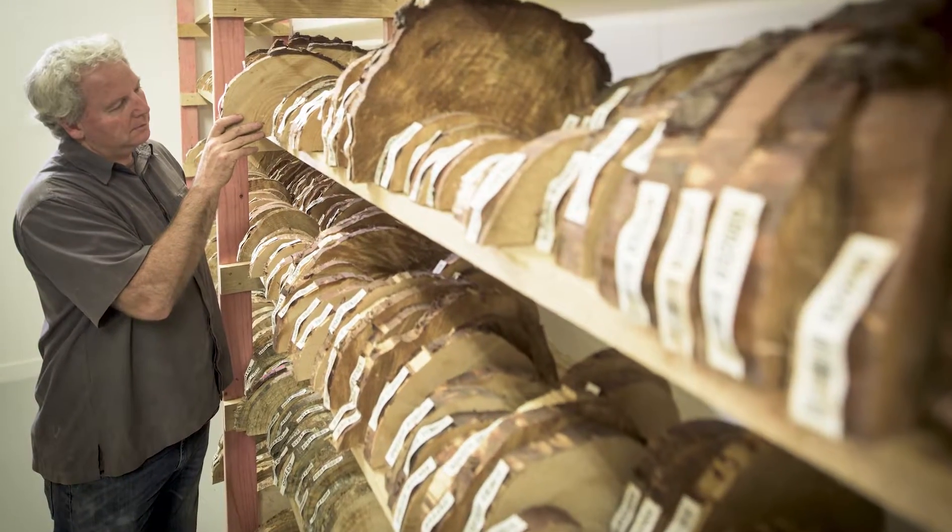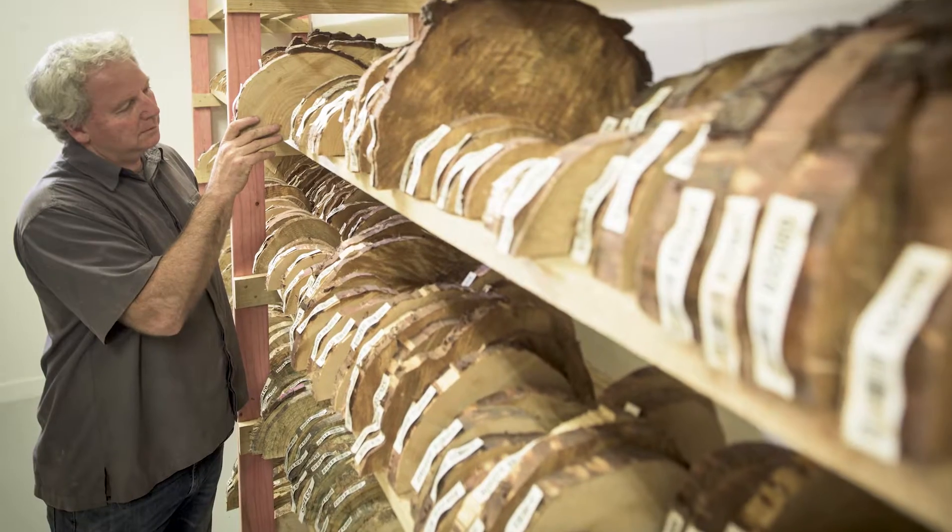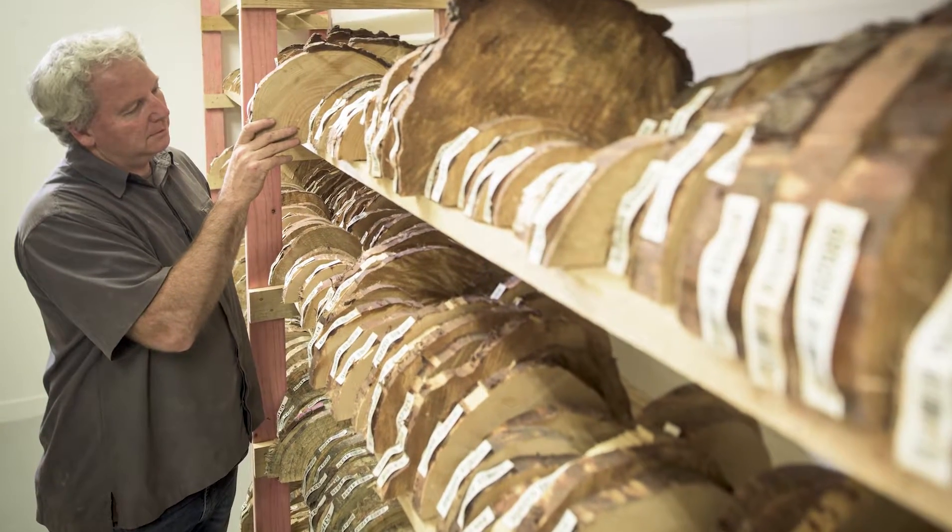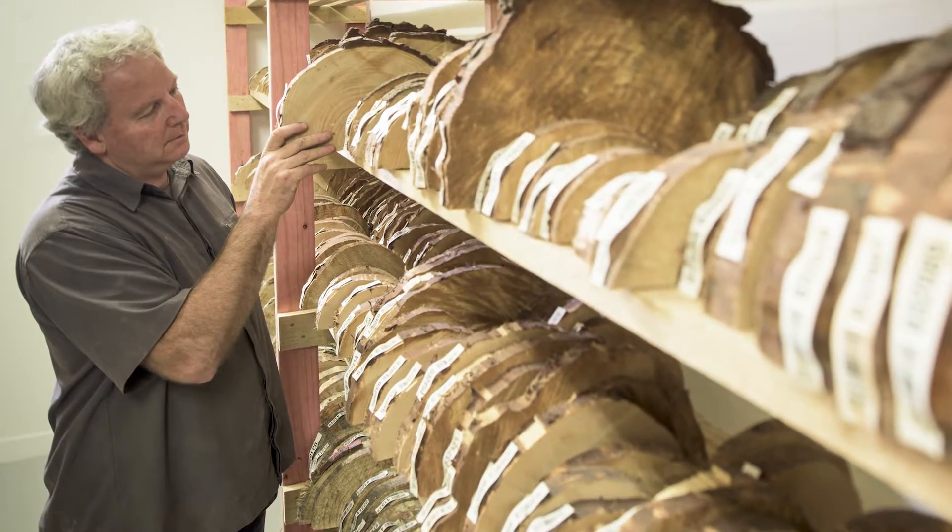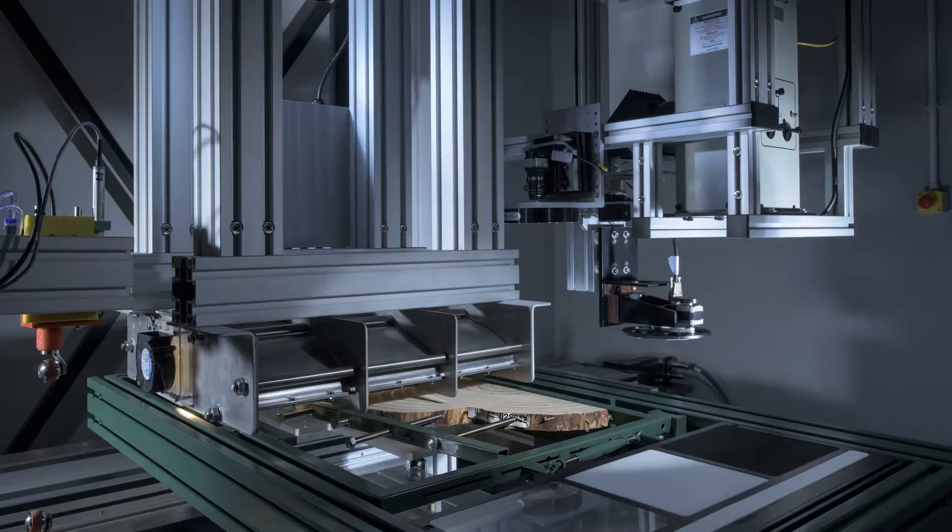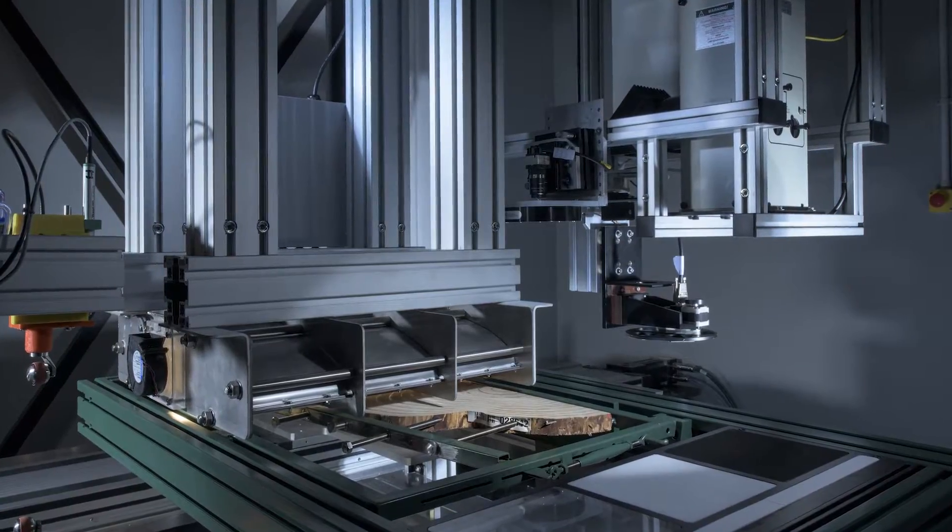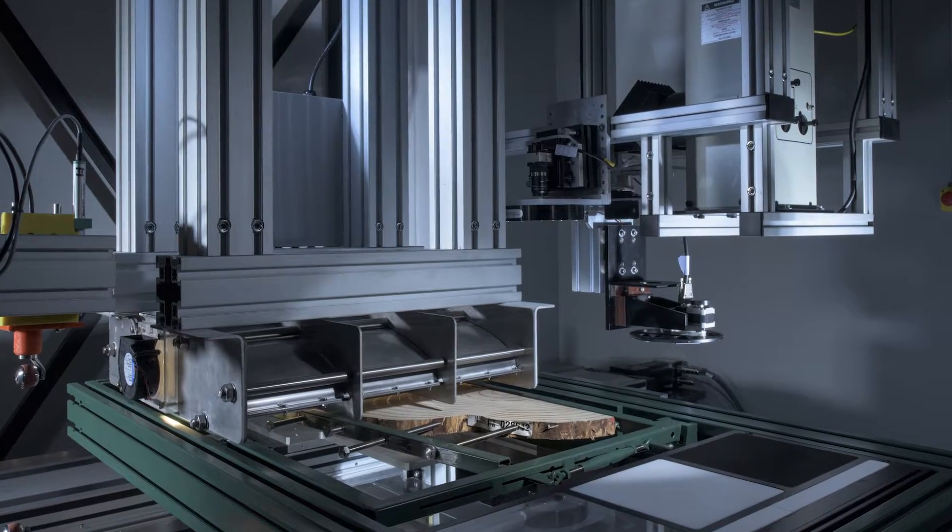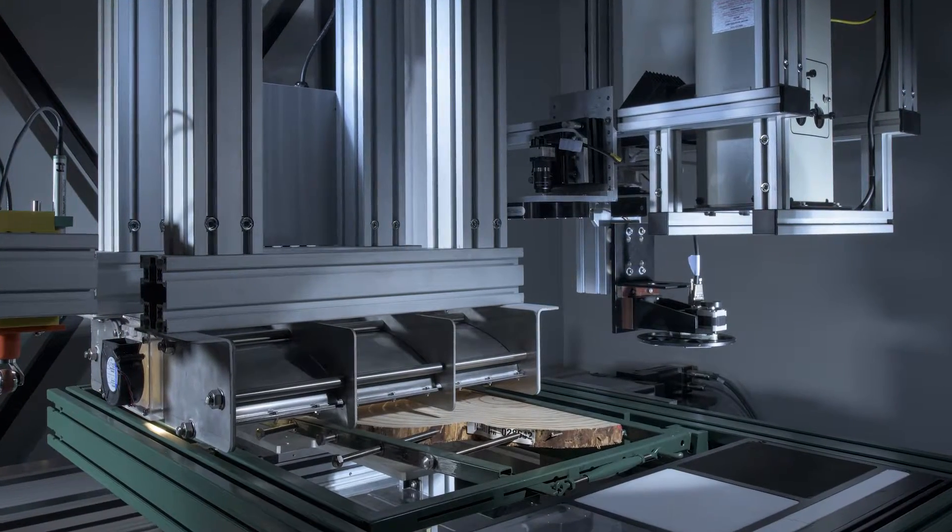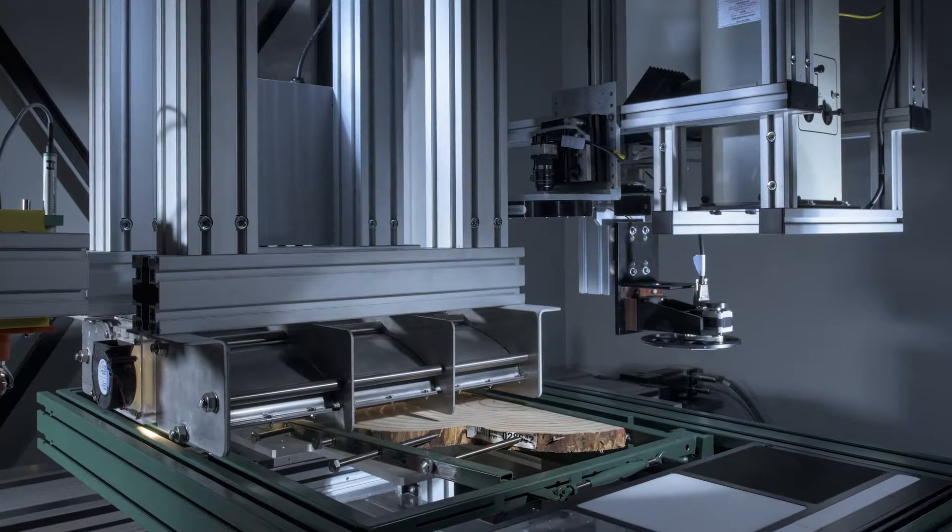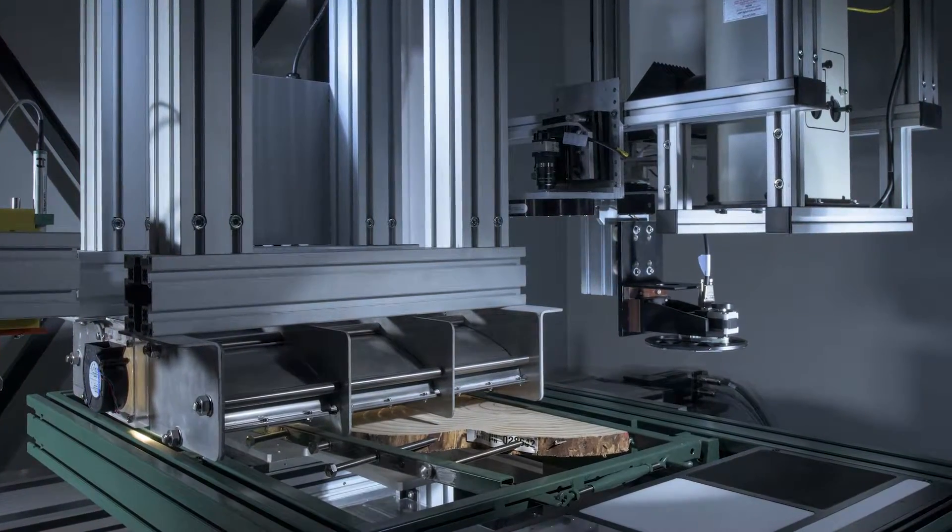Discs are cut to a uniform thickness, bar-coded and stored in a controlled environment. The DiscBot measures density, spiral grain angle, microfibril angle and wood chemistry.